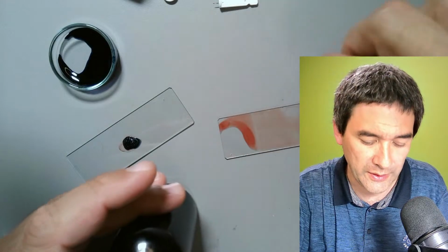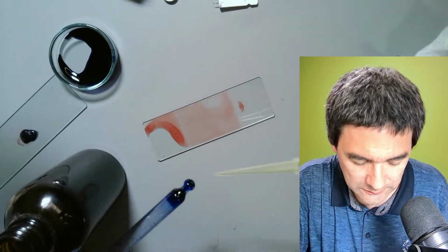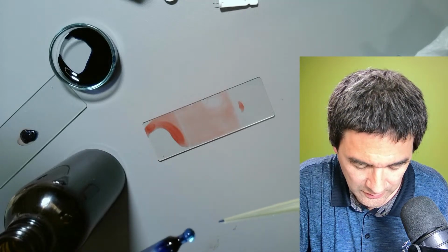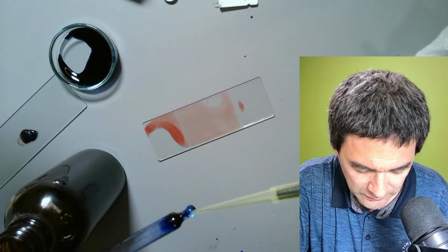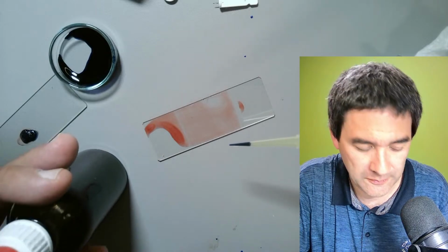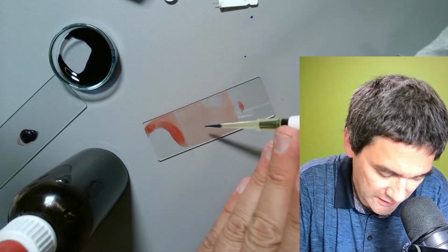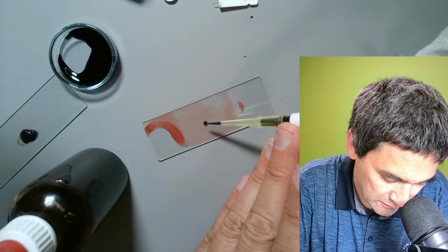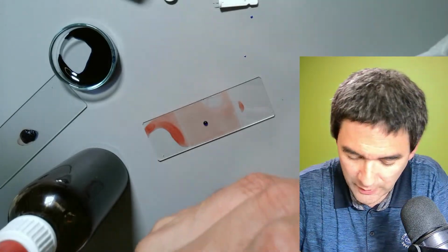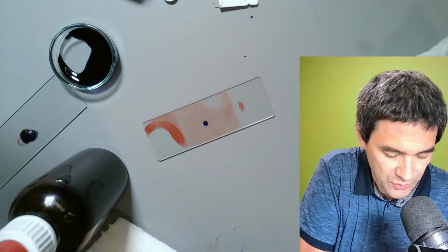And the way that I do that now is as follows. It's not very much. Okay, here, that's better. So I have to wipe. Let's give it a small drop here. Cover glass goes on top. Never tried this technique, and let's see how this works.